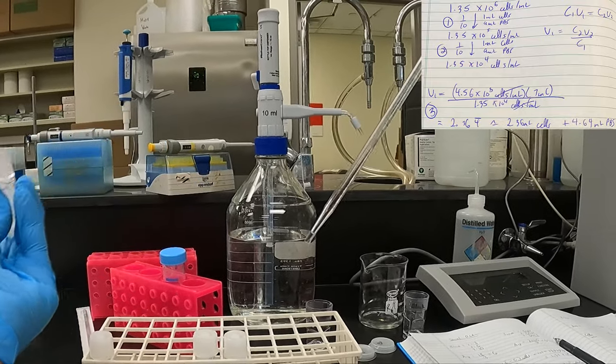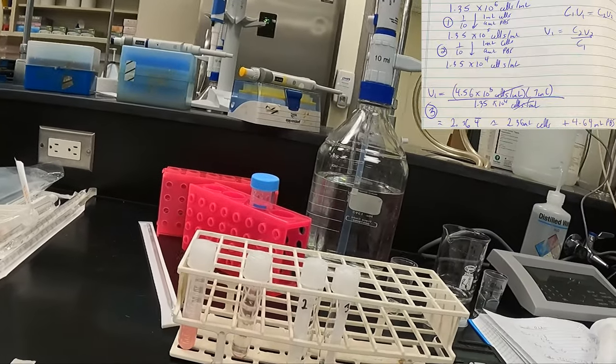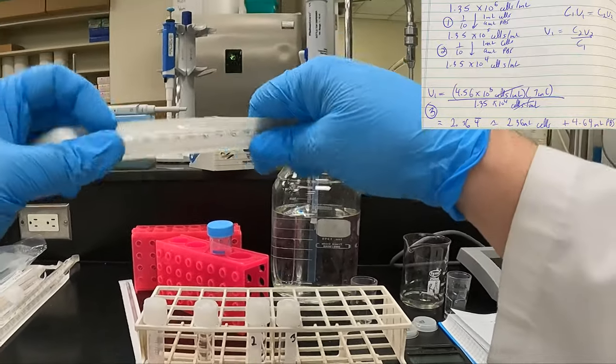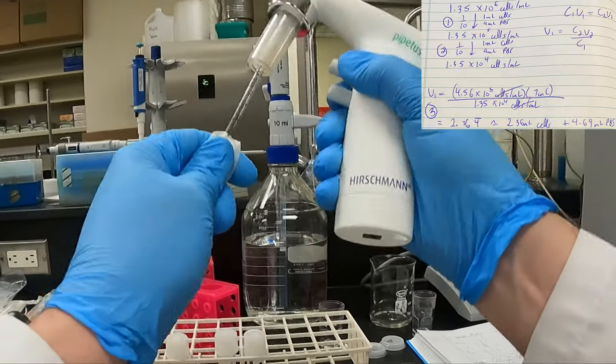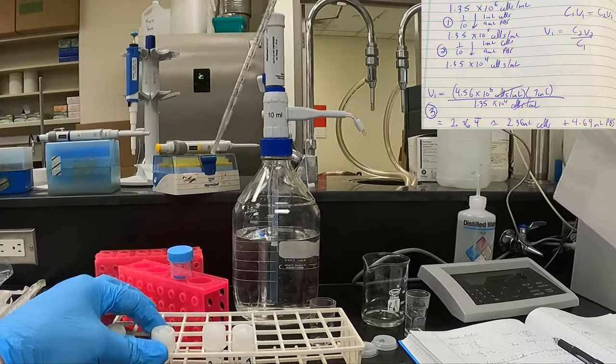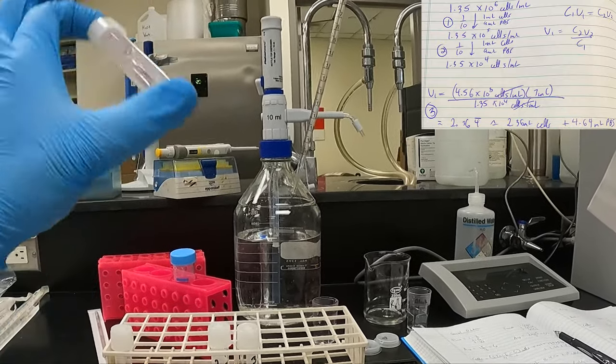Now, when doing my cells, I make sure I mix it. And I'm not going to reuse this pipette. I'm going to get another 2 mil pipette. Cells could be on the outside and they could add additional concentration of cells to your next tube. Again, before we sample it, we make sure it's thoroughly mixed.